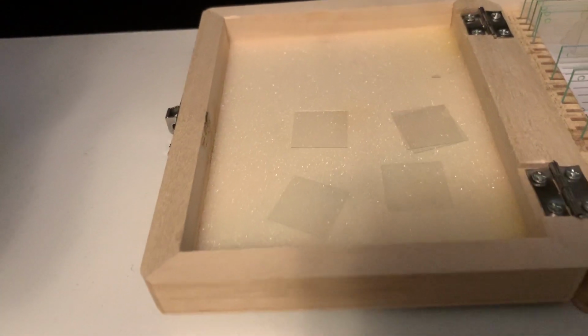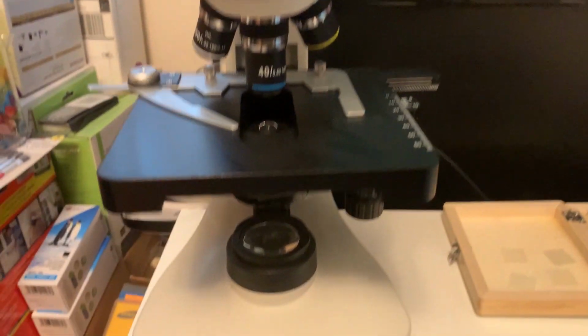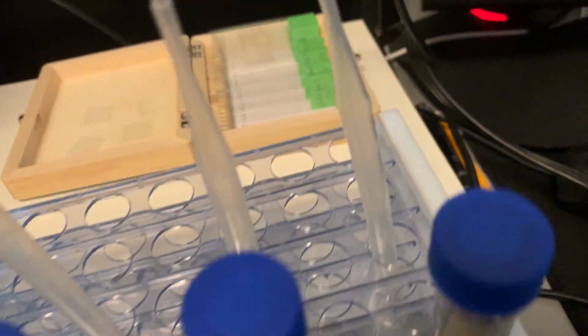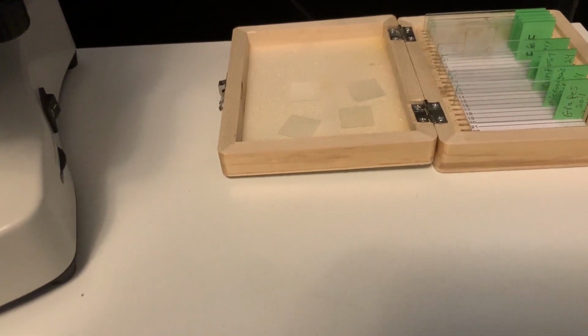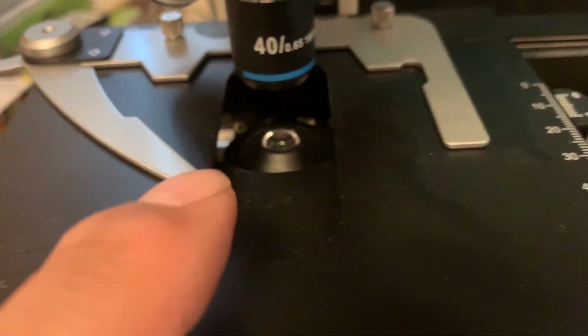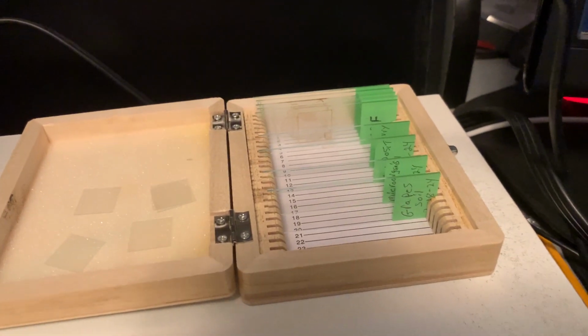Okay, so here we got them all labeled. And here's our cover glass. And here's our microscope, of course. And here's our specimen. Now, we're going to have to get our specimen onto one of these slides, put a cover glass on it, and then we can put it on the microscope here. And then you guys can watch it on the computer screen live as it's happening. So I'm going to try to get the next step here and see if we can move on from here.